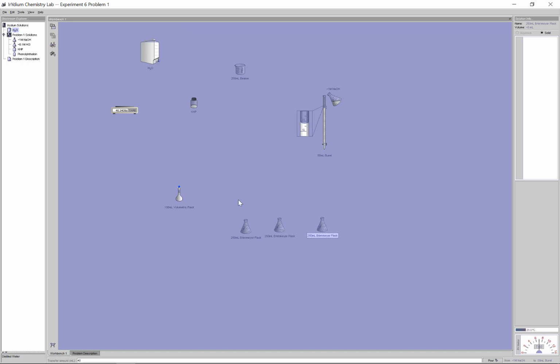How are we going to transfer it here? The first thing you're going to want to do here is pour the solution. I already know in this it's exactly 100.00. Let's just dump this back into a beaker, probably a clean beaker there. The reason why we want to transfer it back into a beaker is the next piece of glassware we need is called a pipette. I don't want to pipette directly out of a volumetric flask. So now that, again, the beaker has a wider mouth here, the beaker is a lot easier to pipette out of. So let's just go to the side here, pull out a pipette.